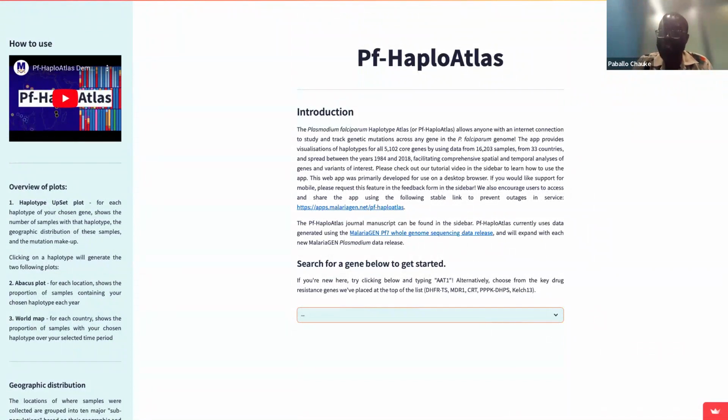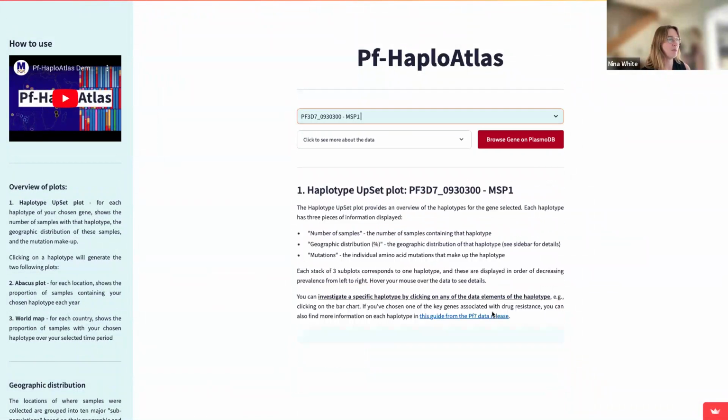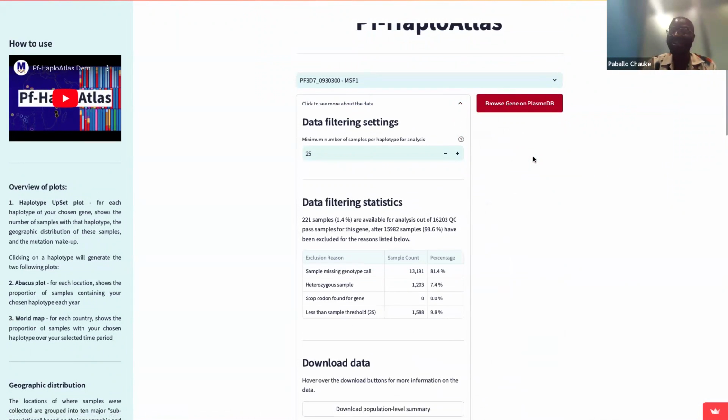Thanks, Richard. So just to repeat, this is time for demonstration. If you have an idea of a gene that you would like to see, please kindly raise your hand. Helga is asking about another MSP1. Okay, that's from the Q&A. Thank you. MSP1. Let's type that in. Are you happy to say anything about why this gene is of interest to you? Helga, you can unmute or type in the chat, but I'd encourage you to speak if you can. If you are comfortable, please raise your hand and then we can unmute you. Helga, would you like to expand on why you're interested in the gene? There's no problem. If not, I can just run through the app.